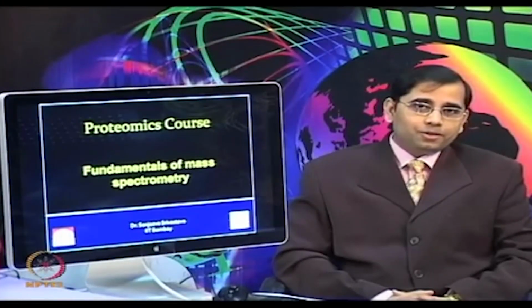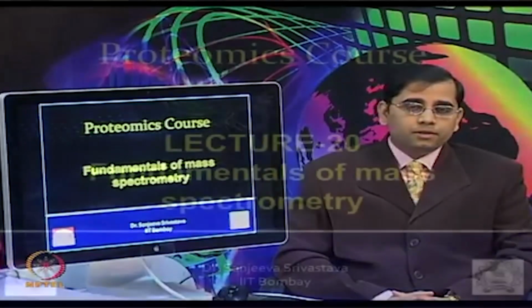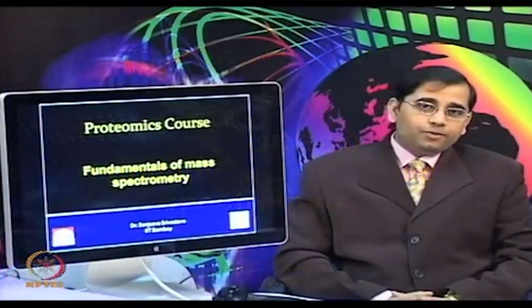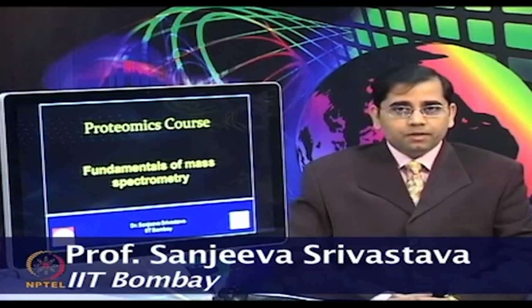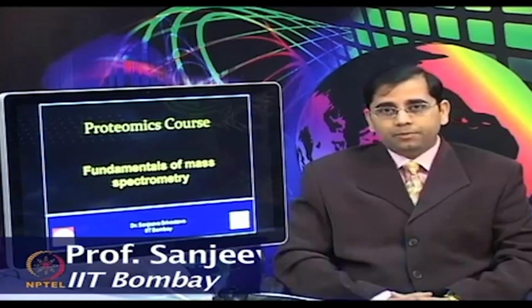Welcome to the Proteomics course. In today's lecture, we will talk about fundamentals of mass spectrometry. So, let us switch gears from the previous module on gel based proteomics and now switch on to mass spectrometry and its various types of applications.